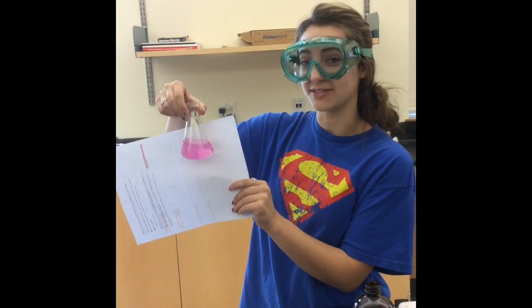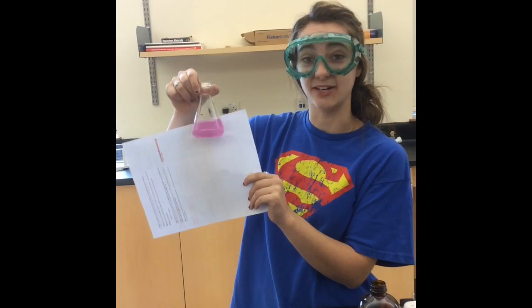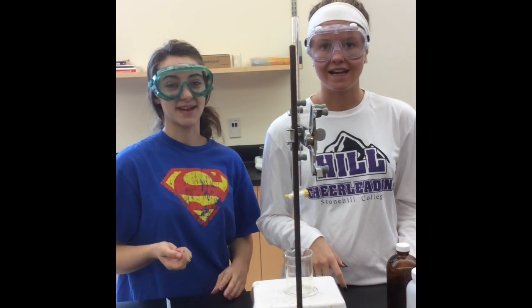Not too dark, not too light. This is perfect. We now know that acid and base is finally neutralized. Now it's time to clean up.